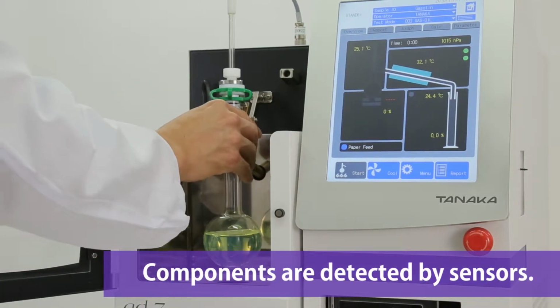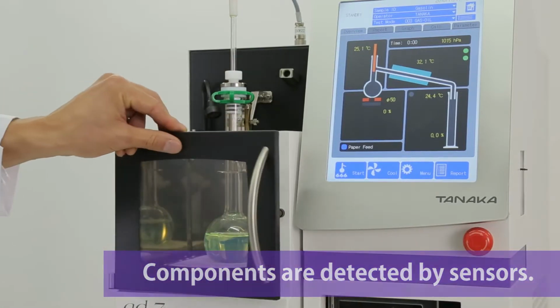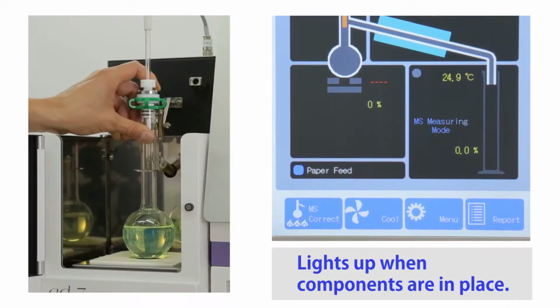The presence of flask and cylinder, cleaning of the condenser tube, and the hole diameter of the flask support board are all automatically detected. This prevents false start of a test.